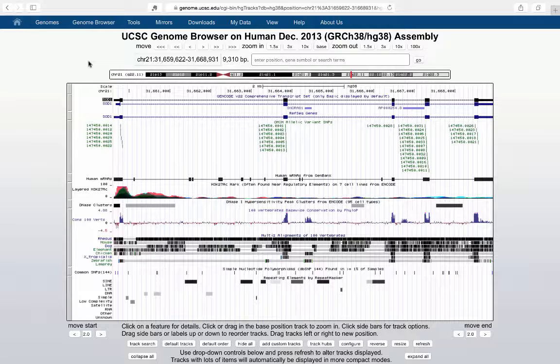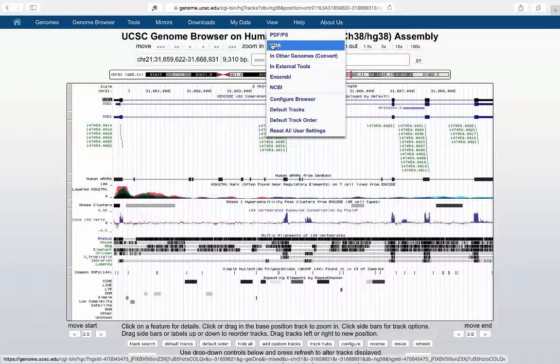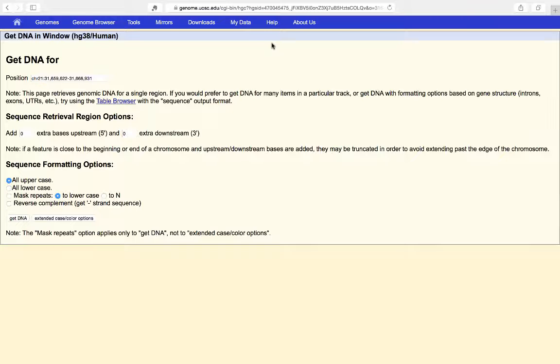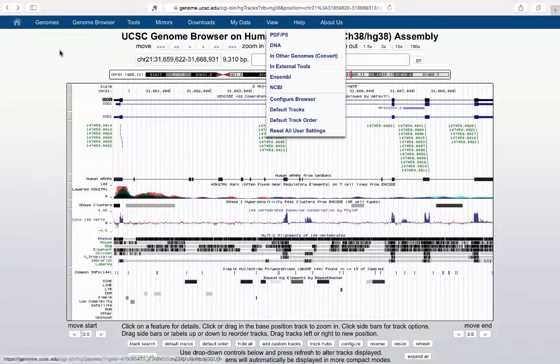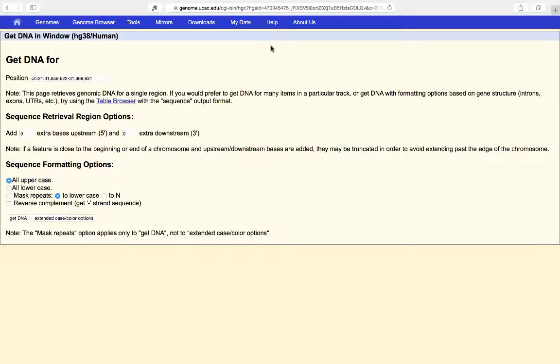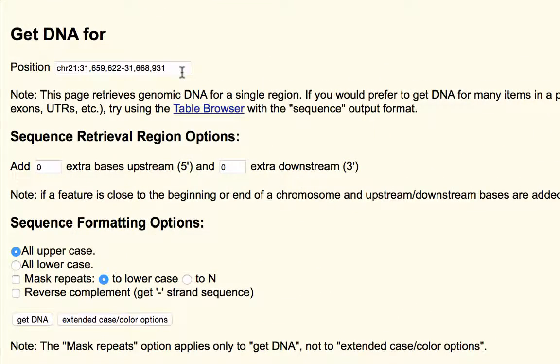To get DNA sequences of the region you're currently viewing in the genome browser, go to the View menu and select DNA. You'll notice the window is on the SOD1 gene again, which we've been looking at. Going to DNA shows you the option to get DNA for the position currently shown in the window.